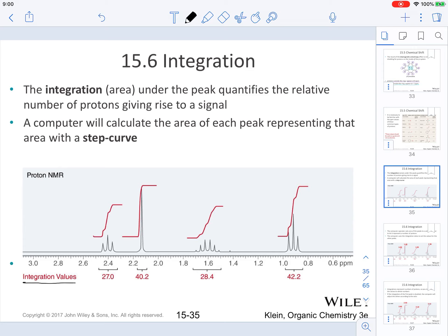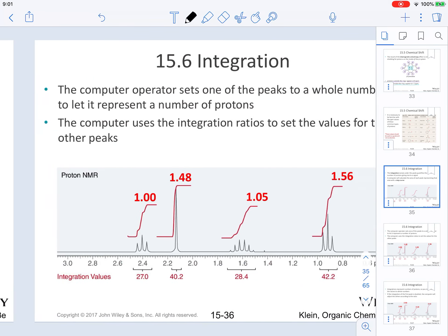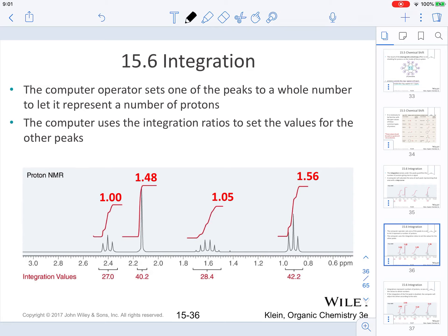Integration values are placed at the bottom of the spectrum. As a computer operator, you have to set one of the peaks to a whole number to let it represent the number of protons. Typically, you take the smallest integration value and divide all other values by it. For example, you take 27.0 and divide it by 27.0, then take all the other values and divide them by 27.0 as well.